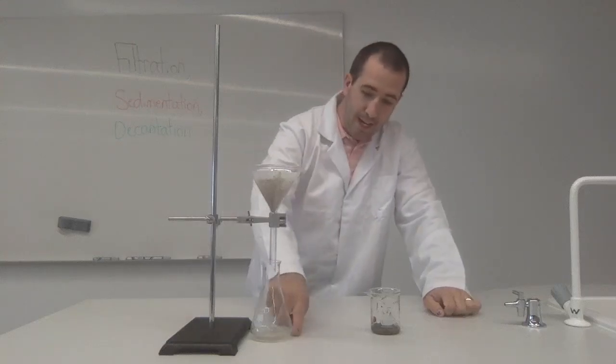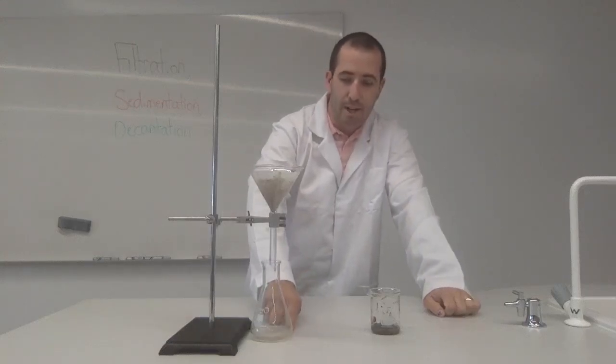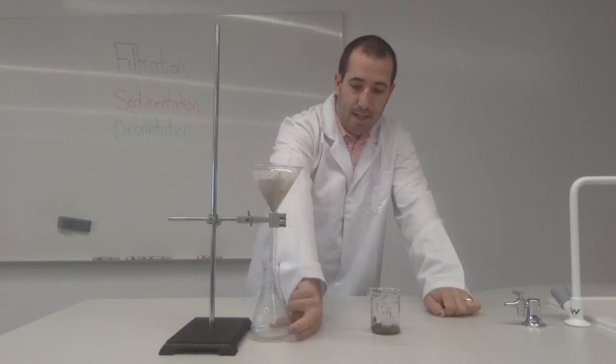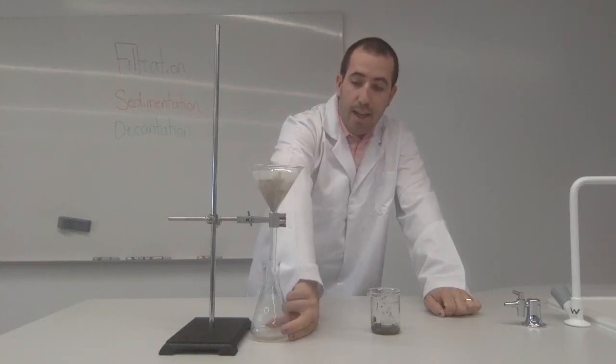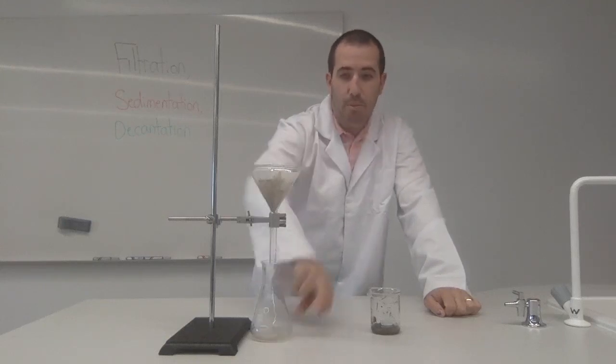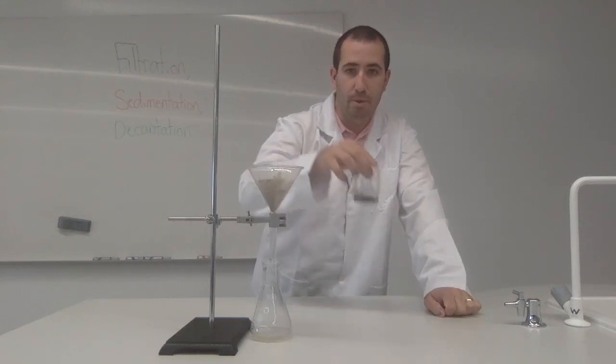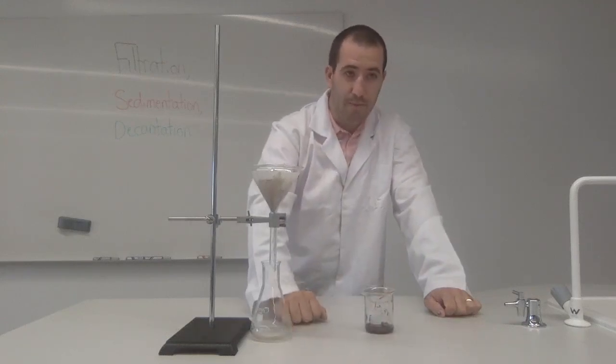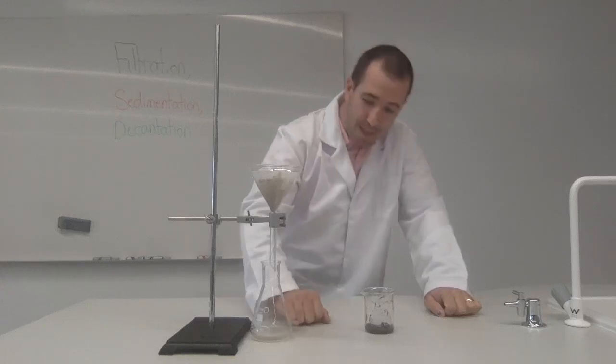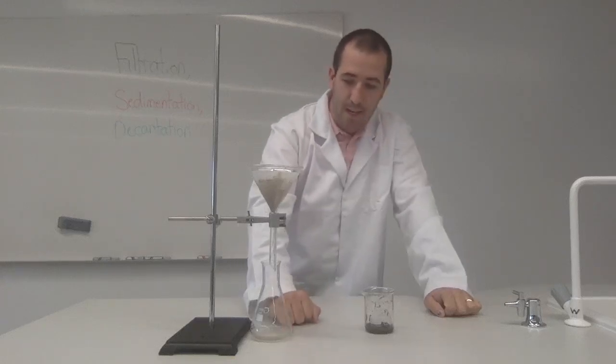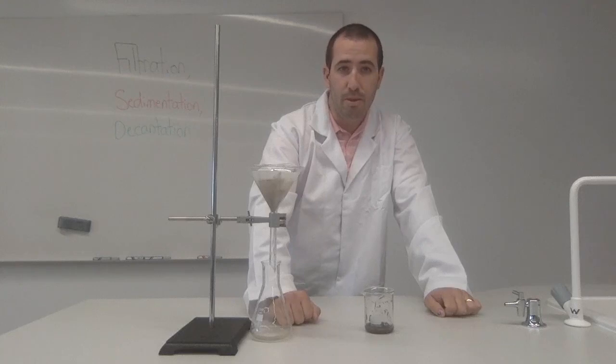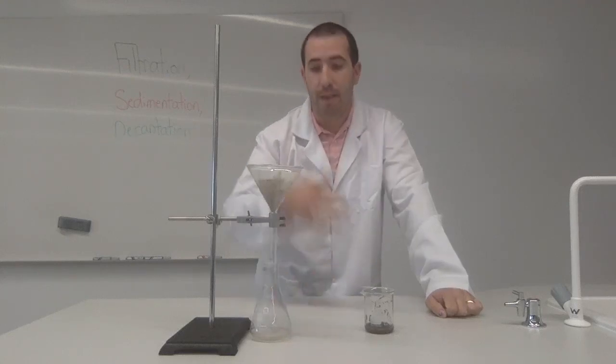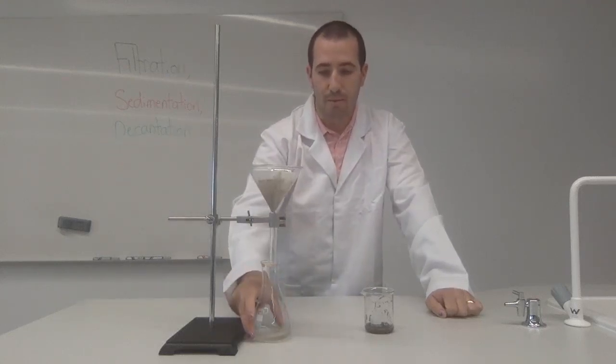Now, what we call this part down here, the liquid being collected, is our filtrate. So that's been collected in here. This is cleaner water than what we had to start off with. So remember, it was all dirty, yucky, you wouldn't drink it. Here we've got cleaner water. It looks drinkable, but there might be some microscopic things in here which are not drinkable. So therefore, you might have to use other separating techniques to get fully clean water.